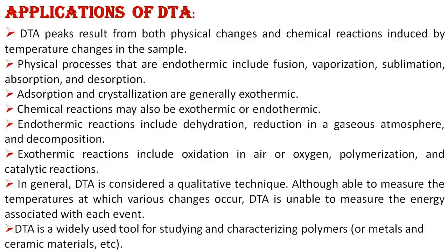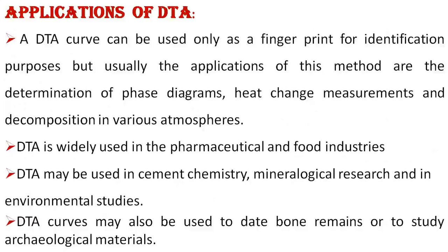In general, DTA is considered a qualitative technique, although it is able to measure the temperature at which various changes occur. DTA is unable to measure the energy associated with each event. DTA is a widely used tool for studying and characterization of metal and ceramic materials, etc. The DTA curve can be used as a fingerprint for identification purposes, but usually the applications of this method are the determination of phase diagrams, heat change measurement, and decomposition in various atmospheres.